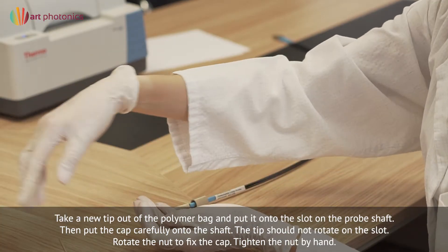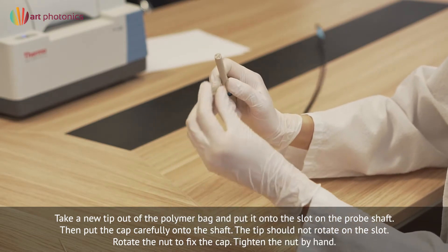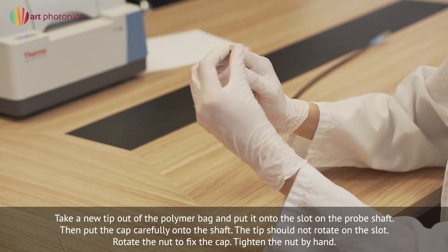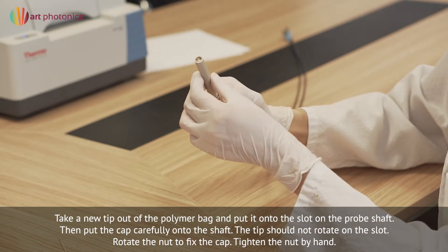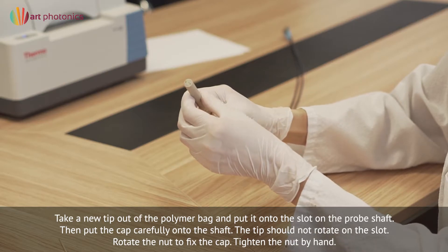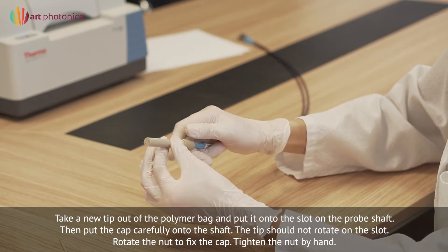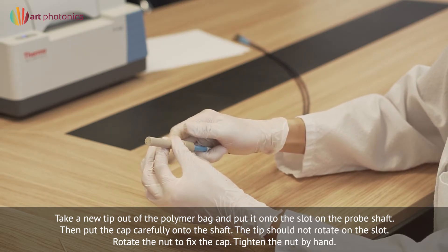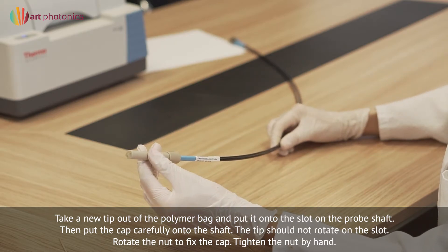Take a new tip out of the polymer bag and put it onto the slot on the probe shaft. Then put the cap carefully onto the shaft — the tip should not rotate on the slot. Rotate the nut to fix the cap and tighten the nut by hand. The probe is ready to start measurements.